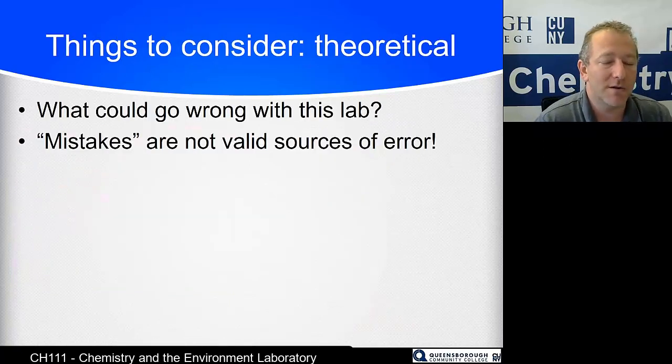So the theoretical stuff here of things to think about for your lab report, well, what could go wrong? There's not a whole lot. Okay, maybe some contamination, but arguably contaminating your different wells is a mistake. Do make sure that you clean those well plates out very, very, very rigorously at the end of the lab. You should not be returning stained well plates. Half of them in the stockroom just look awful because people are returning them not clean. So clean your well plate before you return it to the front of the room.